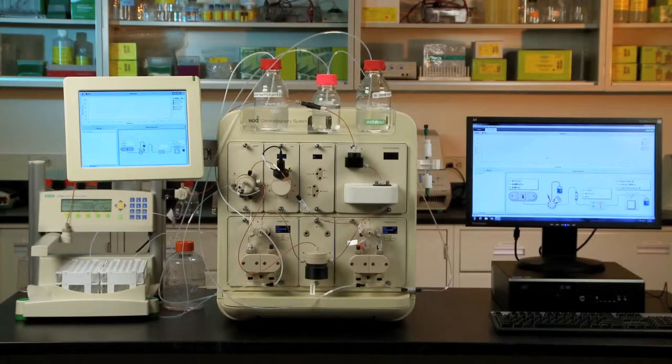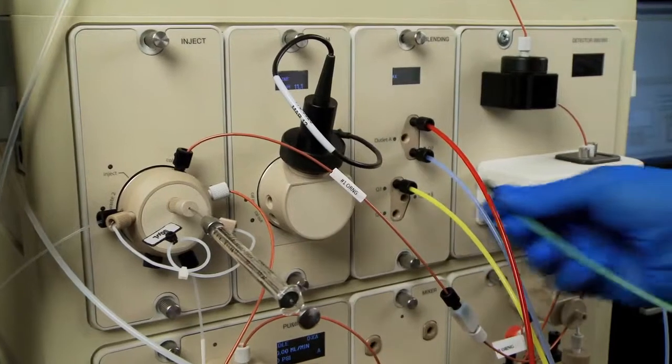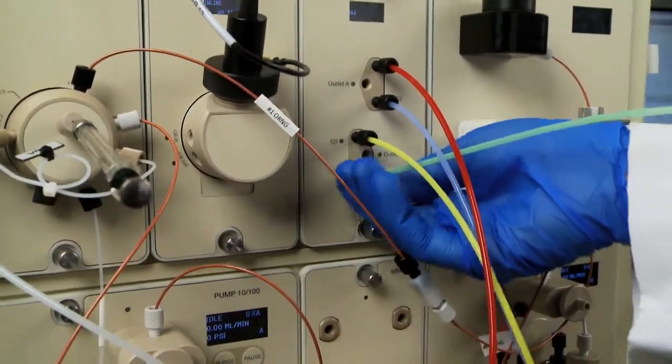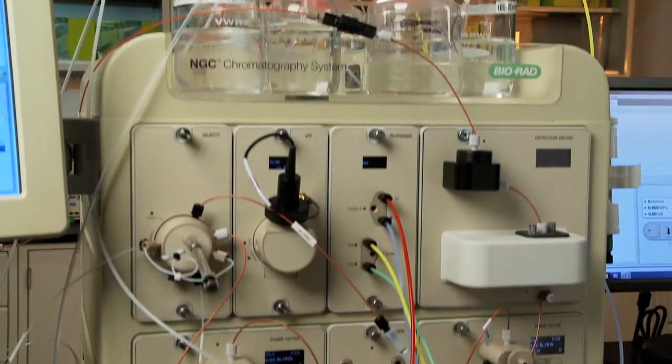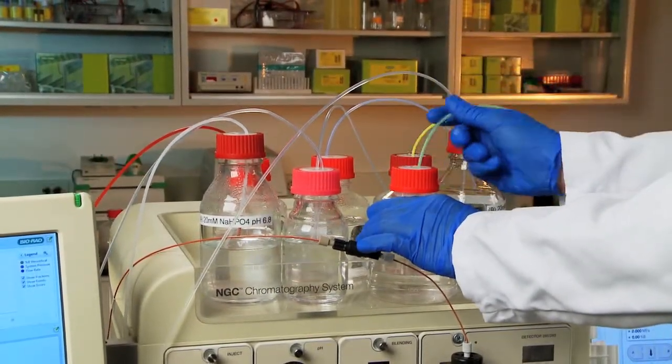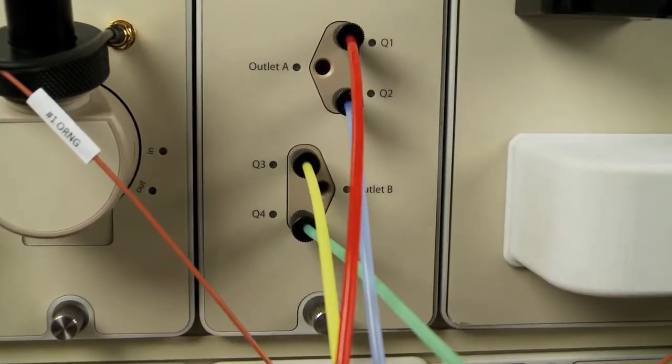Scout systems now require plumbing of the buffer blending valve and pH valve. Plumbing the buffer blending valve: Connect the inlet lines to ports Q1 through Q4 on the buffer blending valve. Place the open end of each line into its intended buffer bottle.